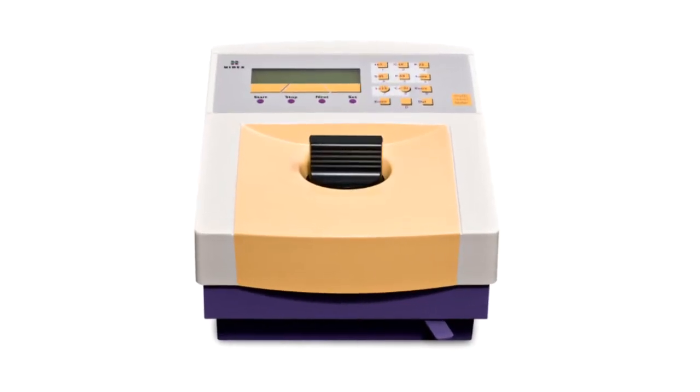Hi, my name is Oliver and I'm a product specialist here at LabLogic for liquid scintillation counting, and I'm here to present the Triathla.